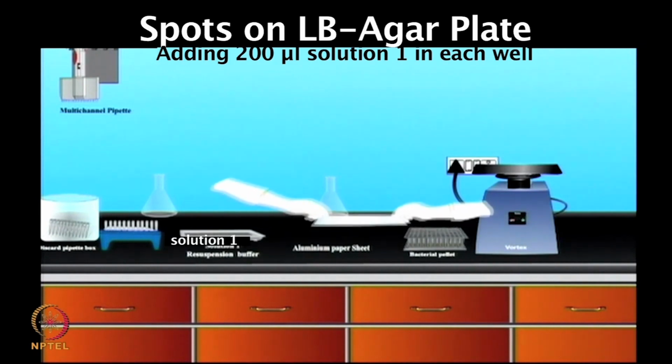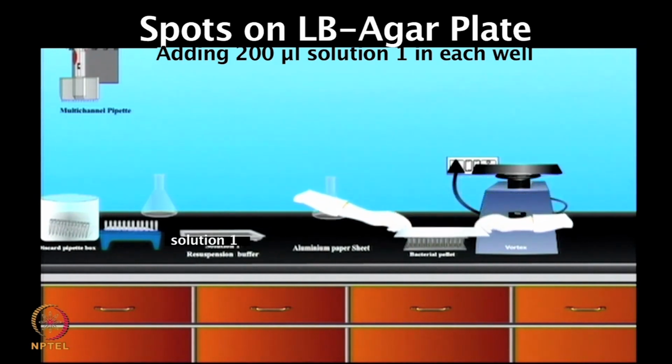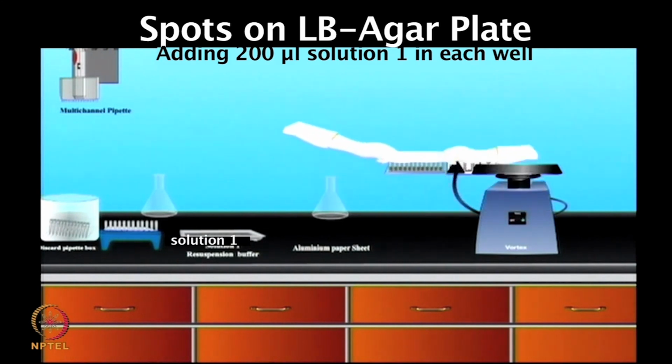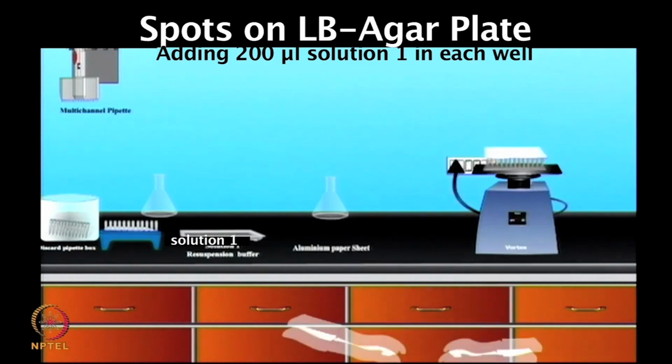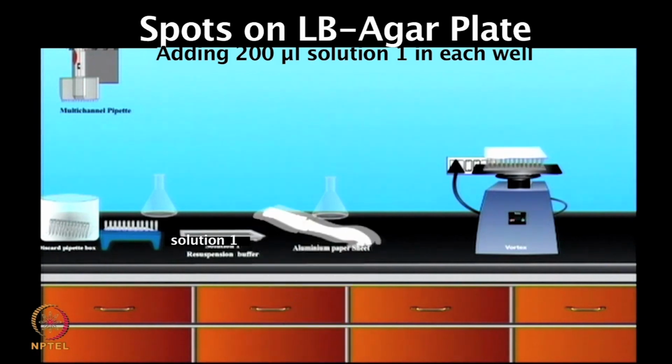After adding the solution, close the plate with a cover seal. Once the seal is placed, you need to vortex it. One can also do it by pipetting up and down or vortexing a few times.